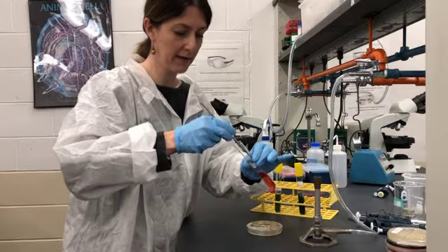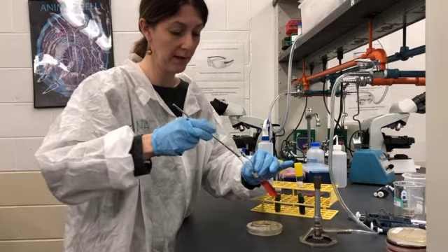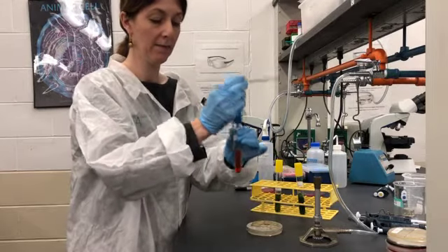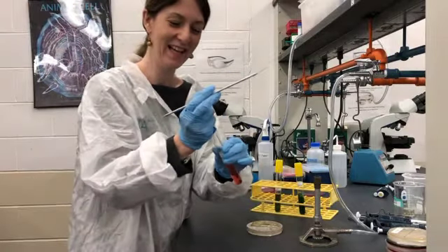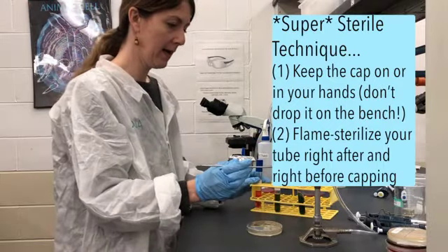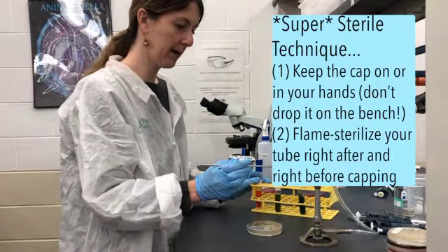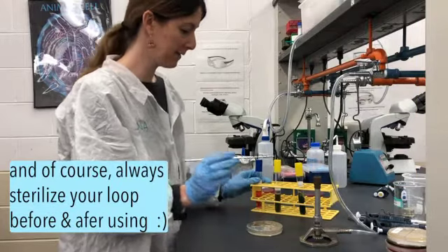I can still see that the bacteria is on there. I'm not going to obsess with it because I don't need too much bacteria on there, but I went back in. Oh, one other thing, flame, and then the cap goes back on. And then before you put this back on the surface, you want to make sure to flame it to sterilize.